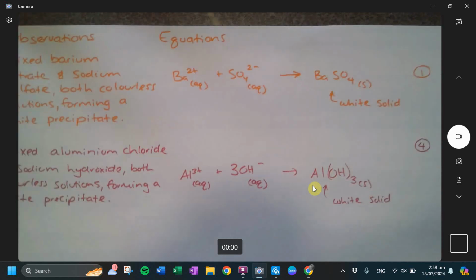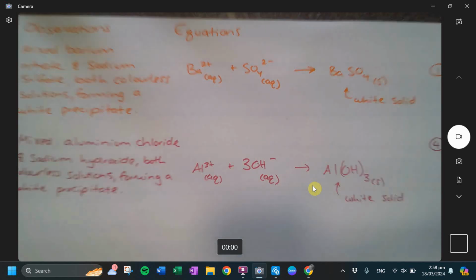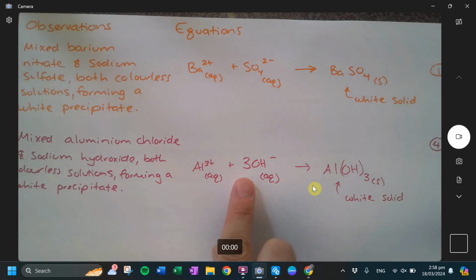All right, I want to teach you guys something special about the ammonia, and then you guys can have the rest of the time to do the others, okay? All right. It is balanced. I put the 3 in front. Just explaining why you put the 3 in front. Okay. All right, keep going.